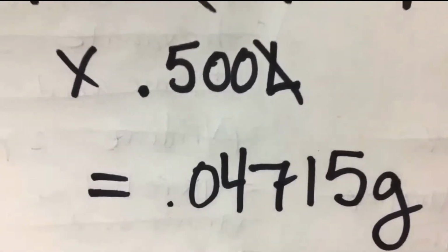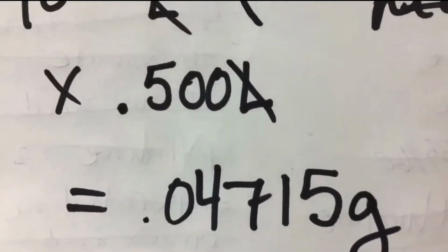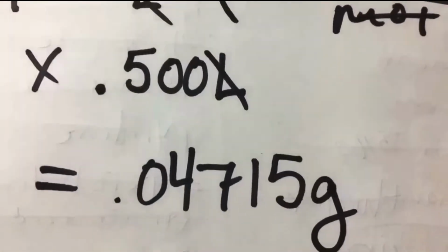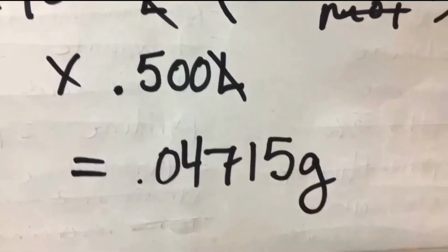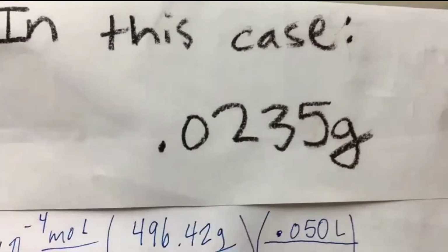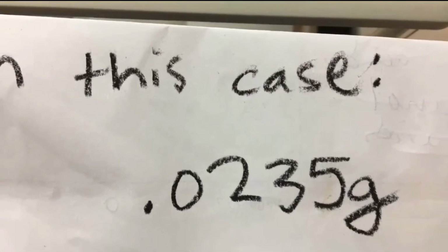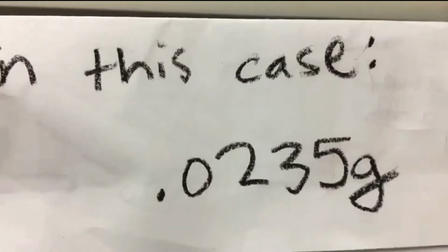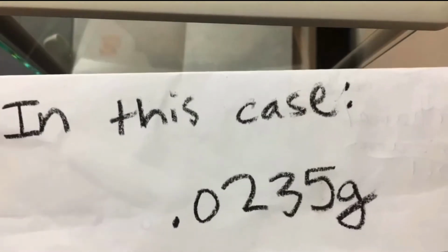In this case, since I'm the only one doing the lab, I'm going to be making half of that for the solution. So I'm making 250 milliliters. With that same math equation, we are going for this amount of grams that I'm about to measure out. I'll also go through the calculation of the molarity towards the end, so we can do that together, and then we'll all have the same molarity in our post lab.